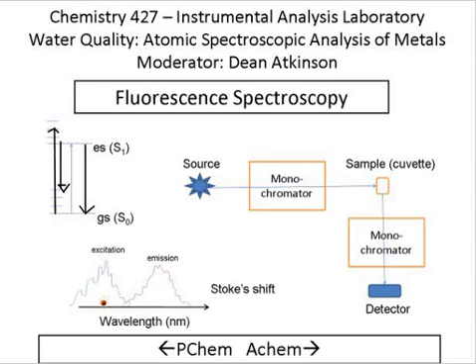The other thing you can do is park yourself on any one of these excitation features and scan the emission spectrum, meaning you look at all the different wavelengths of light that come out of the molecule when you excite at that wavelength. And again, you see this sort of distribution of different energies or wavelengths involved, and basically all those different transitions from the lowest state here down onto these states down here on the electronic ground state manifest themselves in that spectrum. So there are two different types of spectra that you can take, one that looks like an absorption spectrum, one that we term an emission spectrum.